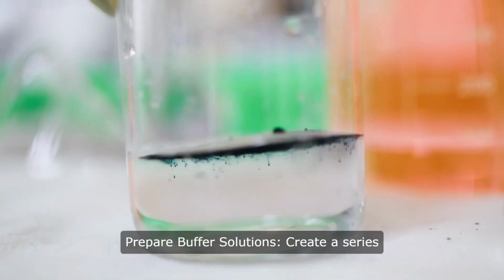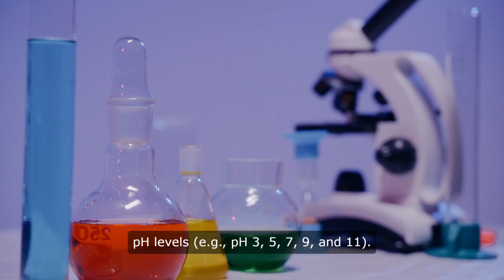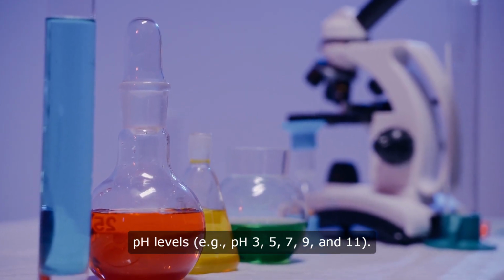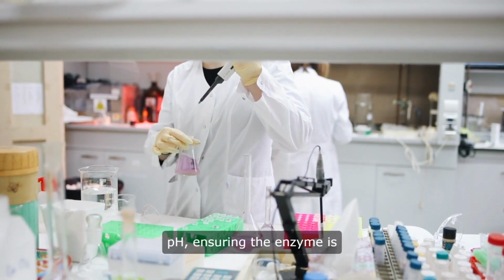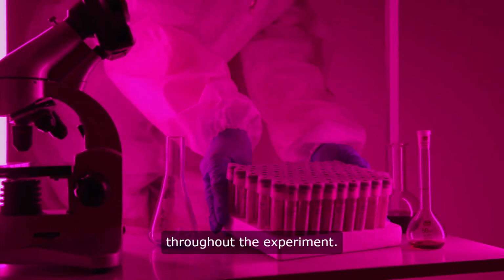Prepare buffer solutions. Create a series of buffer solutions with different pH levels, e.g., pH 3, 5, 7, 9, and 11. Buffers maintain a constant pH, ensuring the enzyme is exposed to the desired pH throughout the experiment.